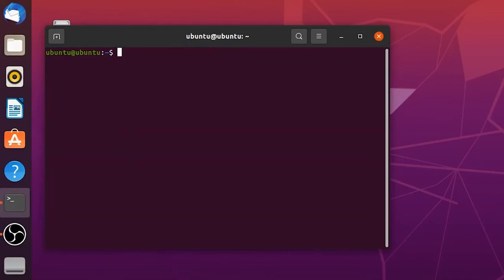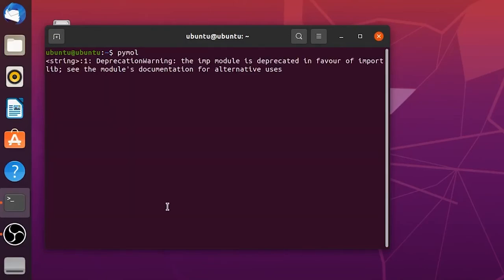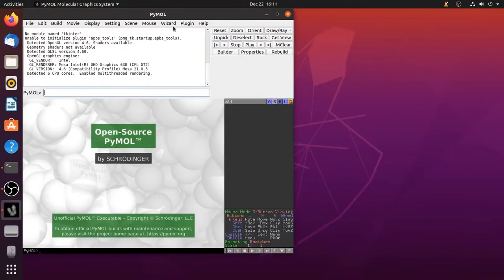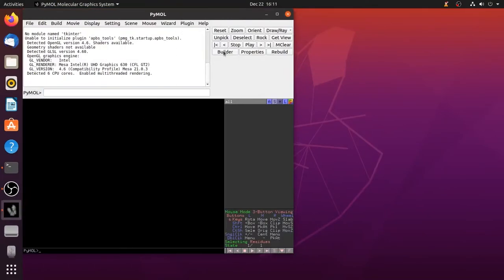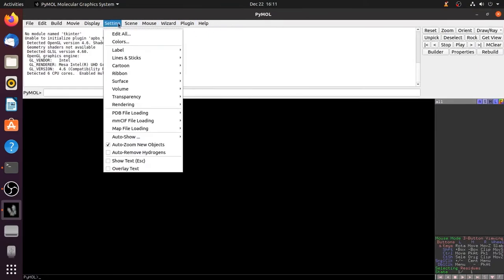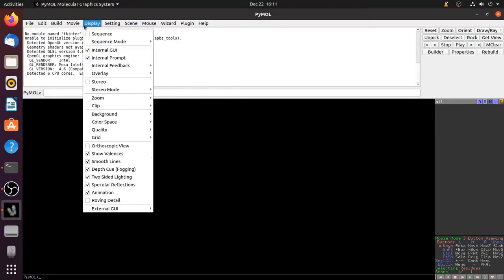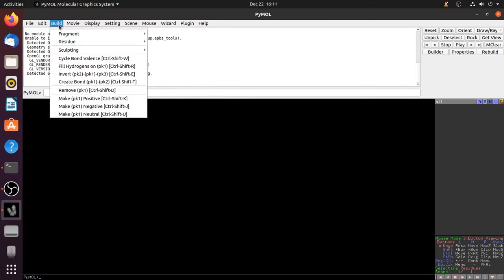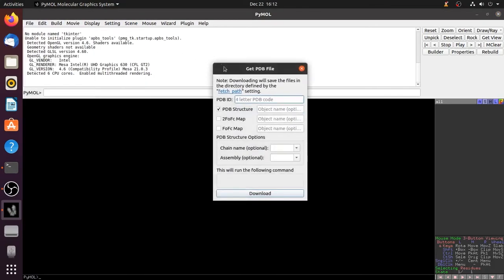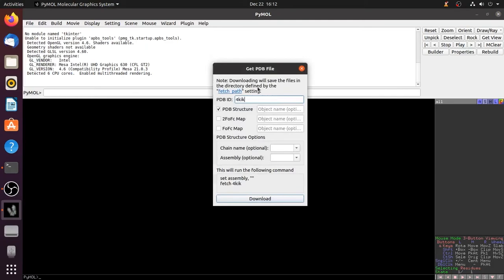To open it type pymol in the terminal and it will open. Now you can use it as usual. To load the PDB enter the PDB ID and visualize as you wish.